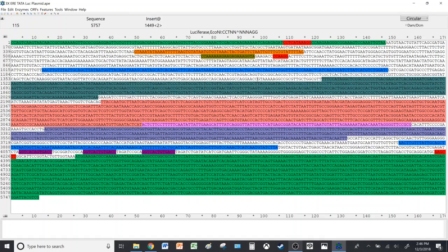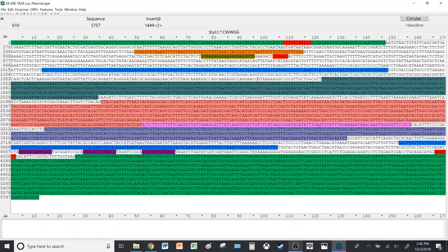If you look at this part, when I hover my cursor on the left of the colon it says the name of the enzyme, and on the right it says where it cuts. That small arrow that points upwards is where the enzyme cuts, so it also identifies exactly where it cuts on the palindrome. You can easily locate that on Google or on the NCBI website if I remember correctly.